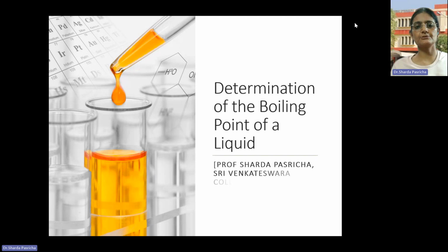Good morning, students. Today we are going to discuss and learn how to do boiling point determination of a given liquid compound.